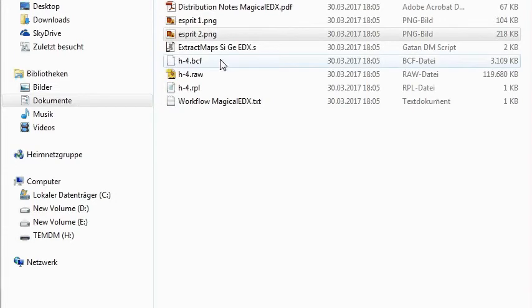So that is native Bruker format and that is raw data. Please note that Bruker also produces a small text file containing important information. You cannot read the raw file without this header, so please keep both these files in one folder.